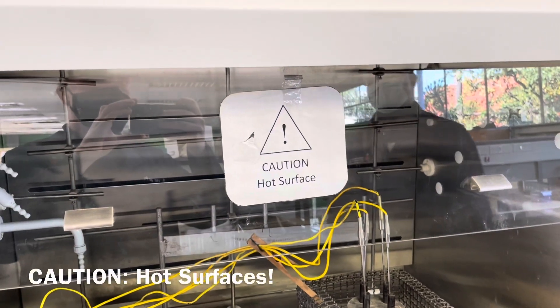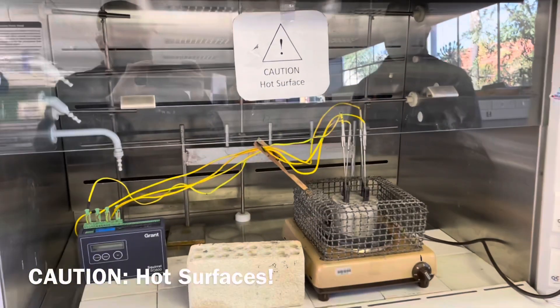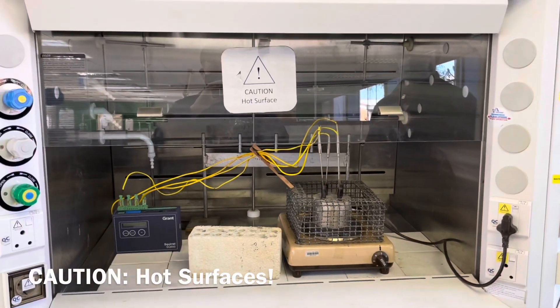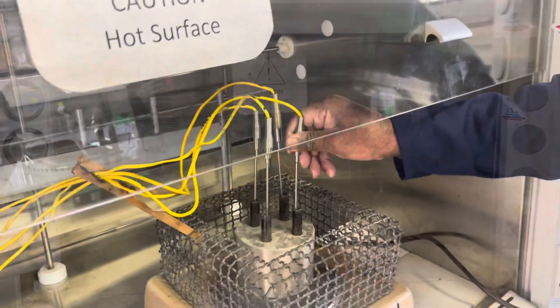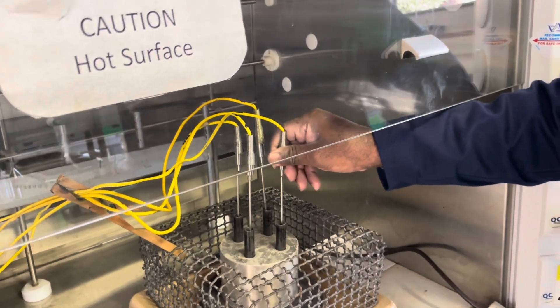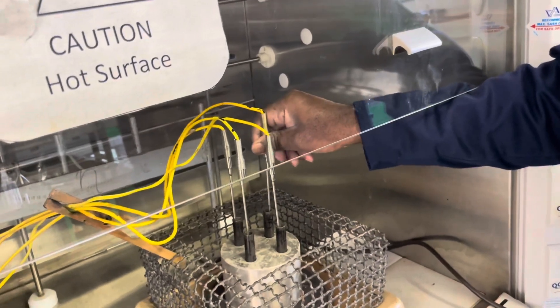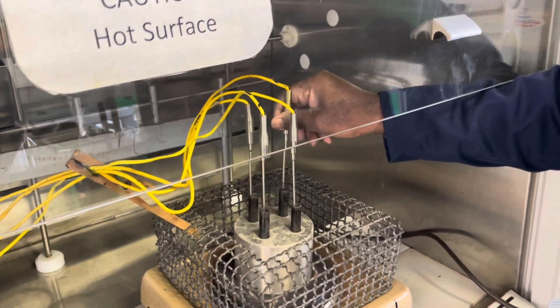Please take extreme caution when working around the heating source since it is extremely hot and you can easily burn yourself. Use the thermocouple to periodically mix your mixtures until all the metal has melted. Be careful, since the thermocouples will heat up in the process as well.